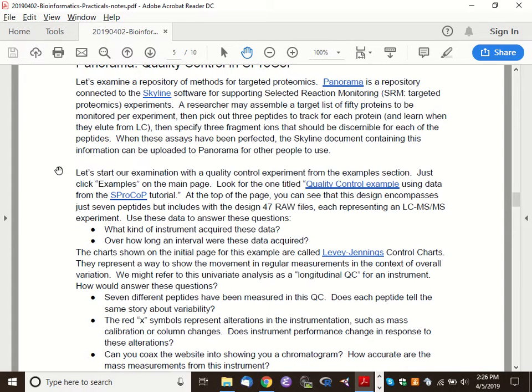Now, we are going to look at quality control. A lot of people have pinged proteomics repeatedly for being an irreproducible science. A lot of this came from the notion that if you run the same sample time after time after time on the same instrument on the same day, every time you run that experiment, every 90 minutes, you're going to get a different list of peptides back. Well, isn't that vexing, right?